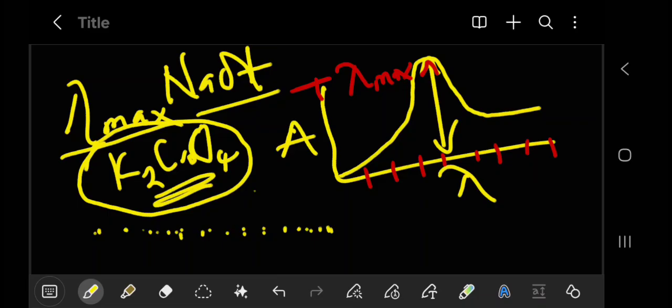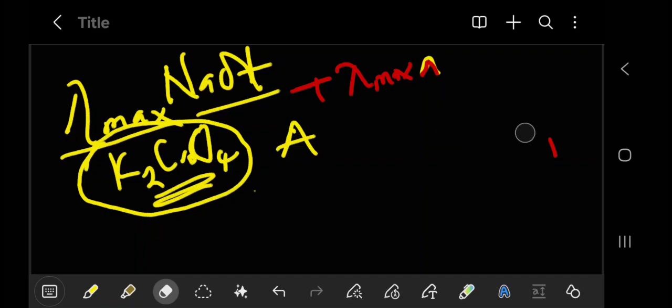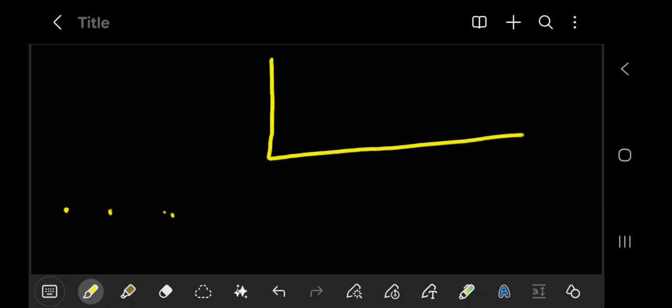So in order to start up the experiment, you have to prepare a series of dilute solutions. Like I said, once you've derived your maximum wavelength, you now have your solutions prepared. Then for each of those solutions, you want to know their different absorbances. Remember, you've prepared a series of solutions like that, with different concentrations, and you now want to know their absorbances.